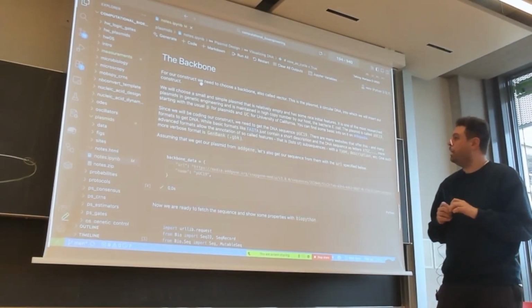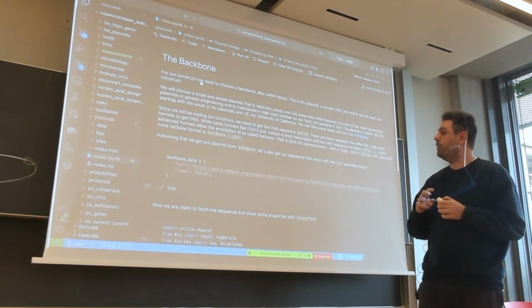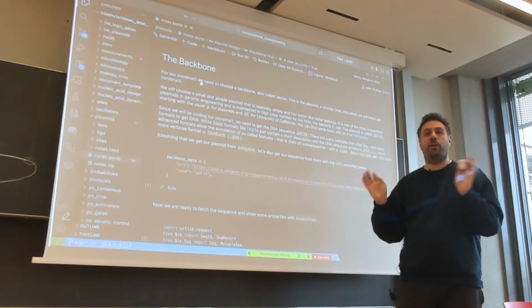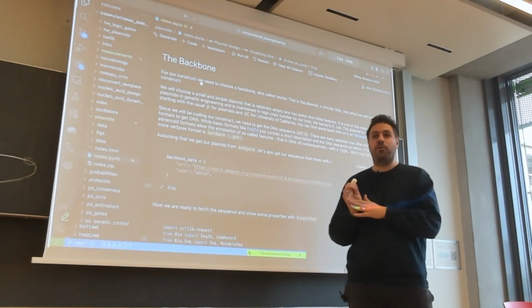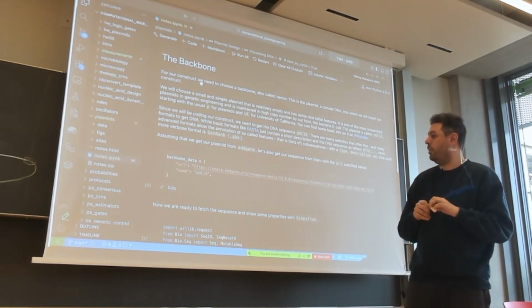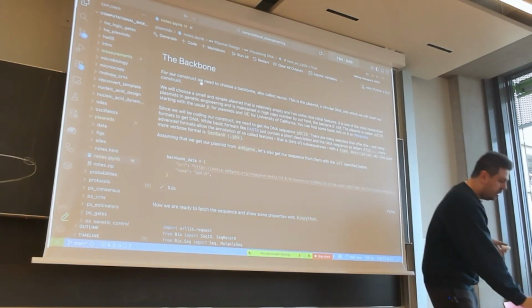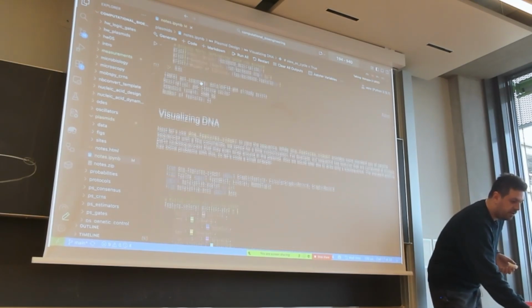We will concretely get, so annotated DNA comes in very different flavors. We will actually get something that is called a GenBank file, as opposed to a FASTA file, which normally has just the DNA and very simple annotation. This is really annotated. Of course, it's always as annotated as the one who wrote it annotated it. But this is a pretty well annotated one. And we will get that from Addgene, because let's say we assume we order it from Addgene. So why not get their annotated file to be sure? So let's do that.